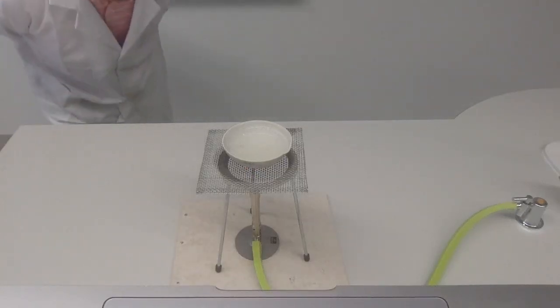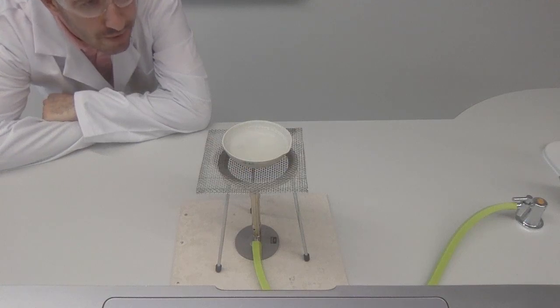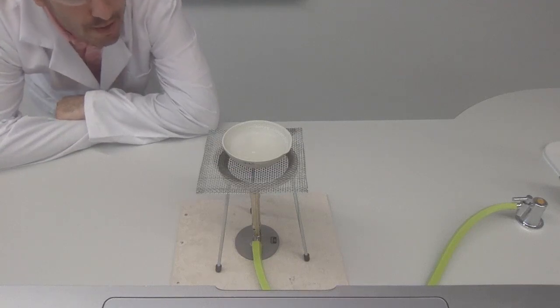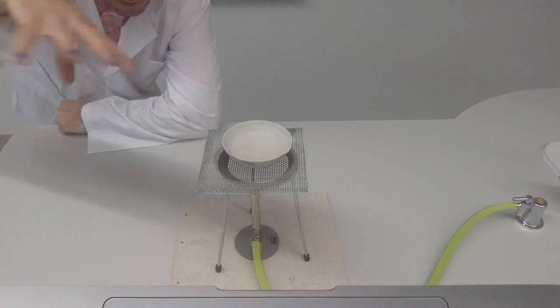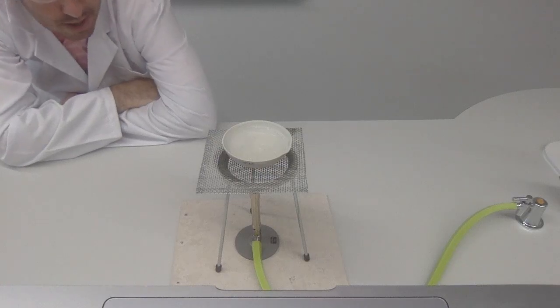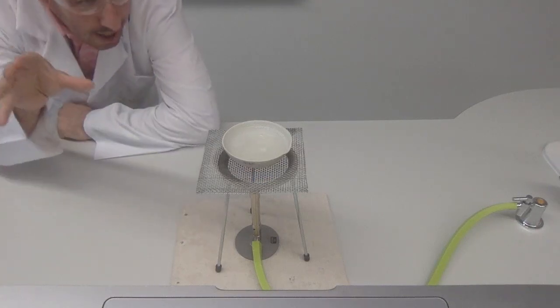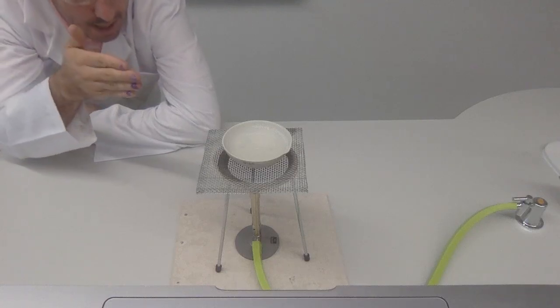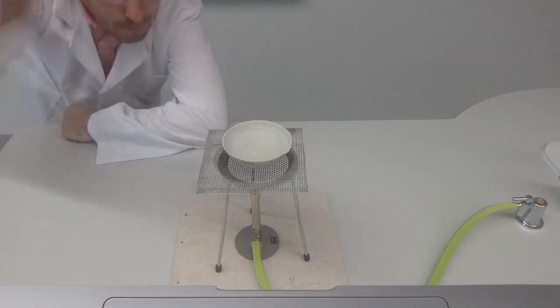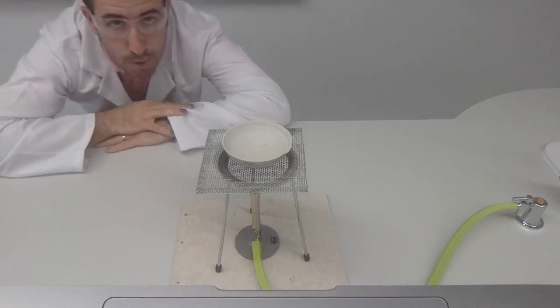Well, this is a better view, isn't it? We're getting a top-down bird's eye view of this process in action. Now, what we can see is that it's almost getting there. So let's continue. What you might be able to see here is that at the top of the basin, in a ring, there are some particles. These would be our salt particles that have crystallized out of solution. You can also see them starting to spit out. Some of the crystals are forming inside the solution, and as they're being heated, they've got energy to jump out of this basin itself. That's why safety first is always important.